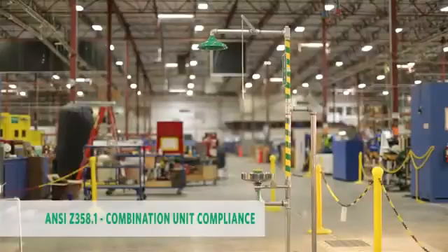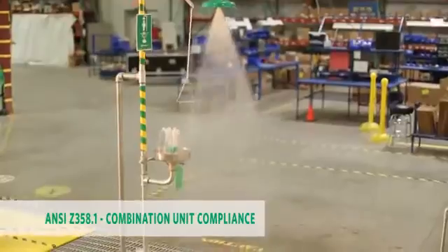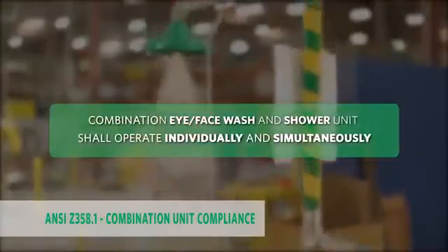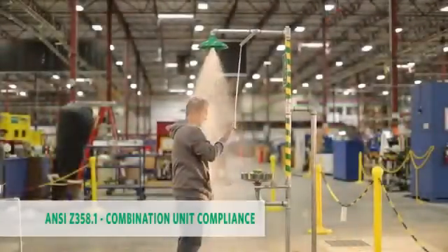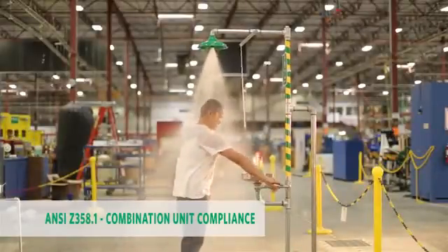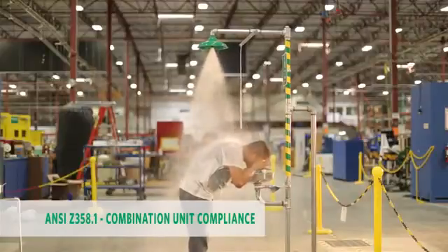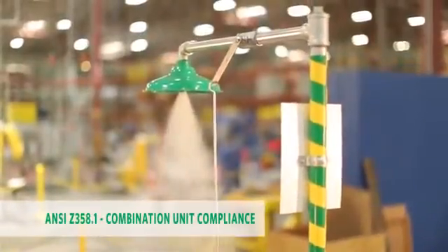A combination unit is an interconnected assembly of an eye wash or eye face wash and shower supplied by a single source of flushing fluid. Components of a combination eye face wash and shower unit shall operate individually and simultaneously in accordance with eye and eye face wash performance requirements and emergency shower performance requirements discussed in previous segments. These systems should be connected to a system capable of supplying adequate flushing fluid to meet the requirements of both an eye face wash and shower when all components are operating simultaneously.